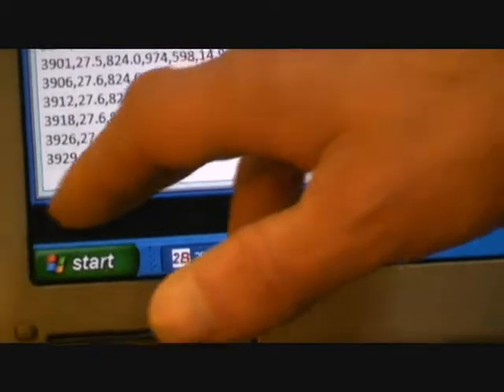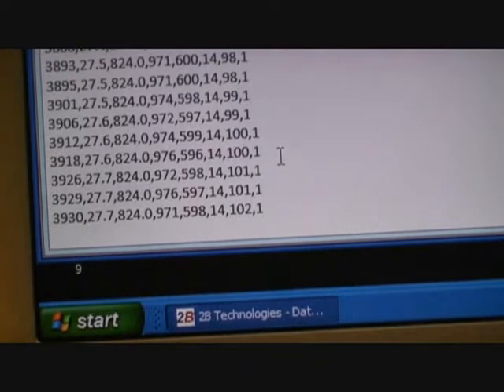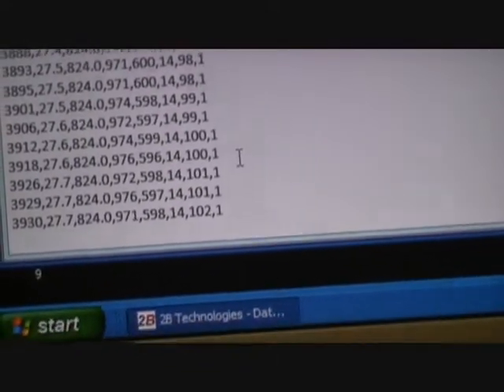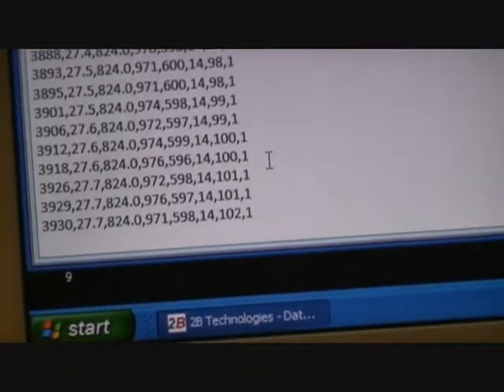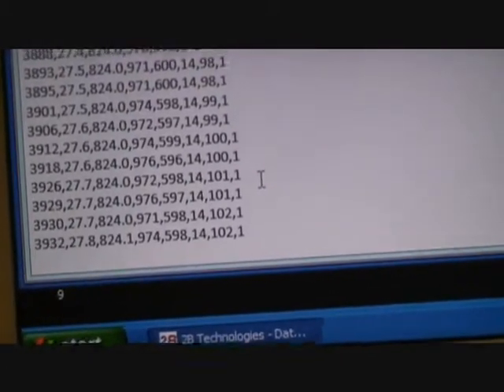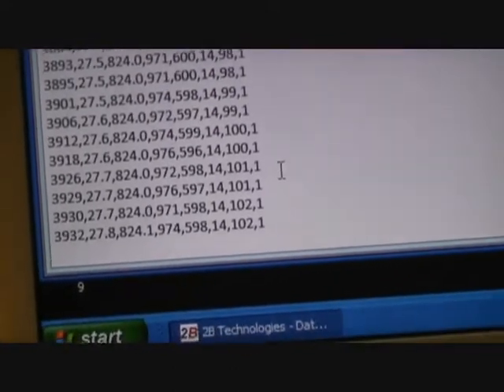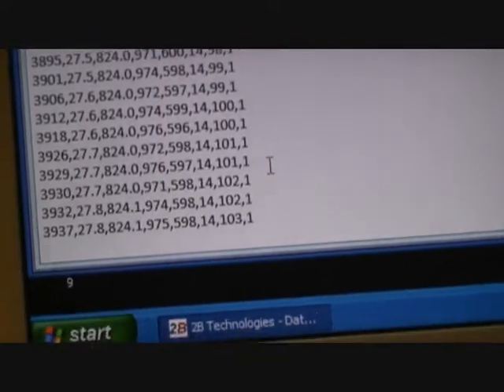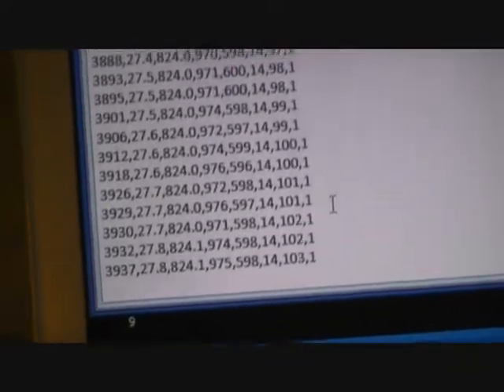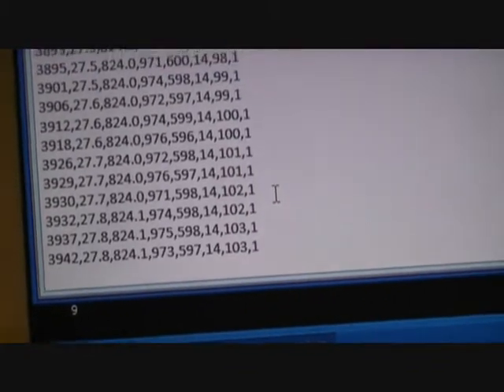The total flow, which is the 5th column over, is going to be around 600 cc's per minute, give or take 20 cc's. The ozone flow rate should be in the range of 10 to 30 cc's per minute. Now, if it's out of this range by a little bit, you're going to want to go back into service mode to adjust those flow rates, and we can talk about that in a later section. But this is what you're shooting for here, and it automatically does it.